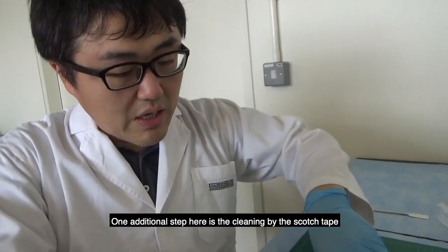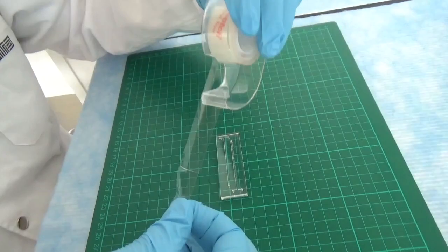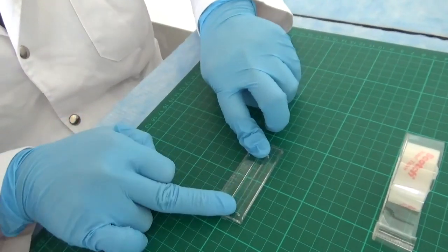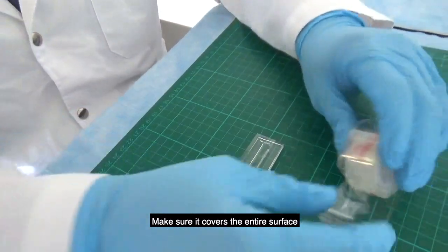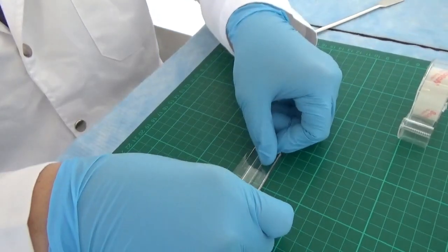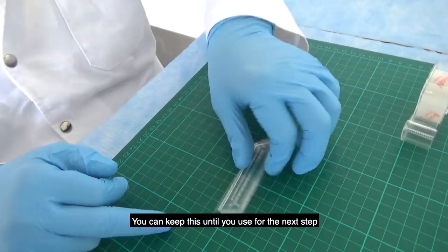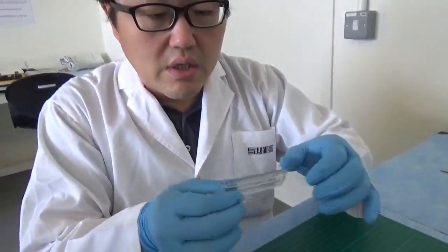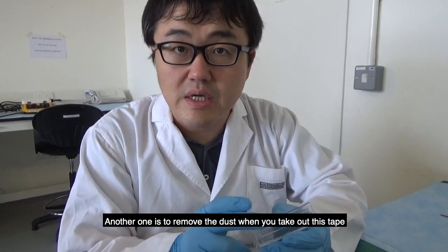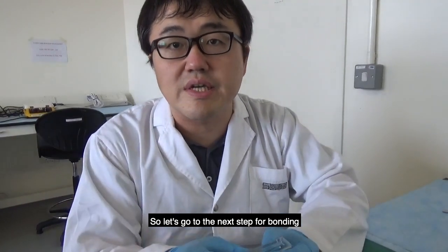One additional step: clean the surface using scotch tape. Take a piece of scotch tape and place it over the entire surface of the PDMS slab. You can keep this tape on until the next step — it does two things: it prevents dust from contacting the surface, and it removes dust when you peel it off. Now let's go to the next step for bonding.